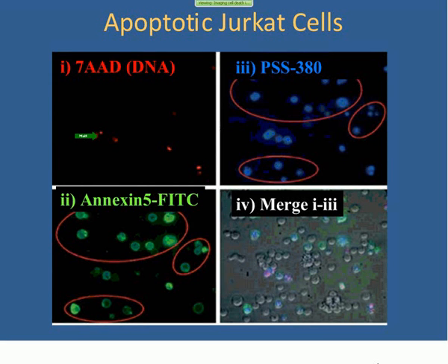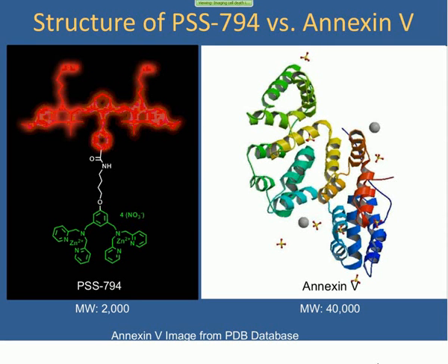This red, which is called 7-AAD, is a DNA stain which marks cells that have had membrane permeabilization. And as I mentioned before, these cells still stain blue, but we know that the membrane is not permeabilized, and thus they are apoptotic, by looking at 7-AAD. So, as one might expect, there is nice co-registration and co-localization with a FITC-labeled Annexin-5 compound.